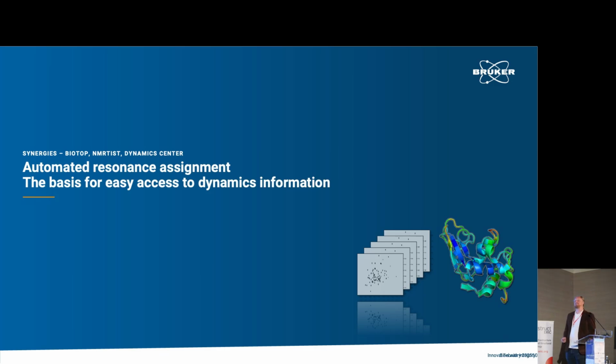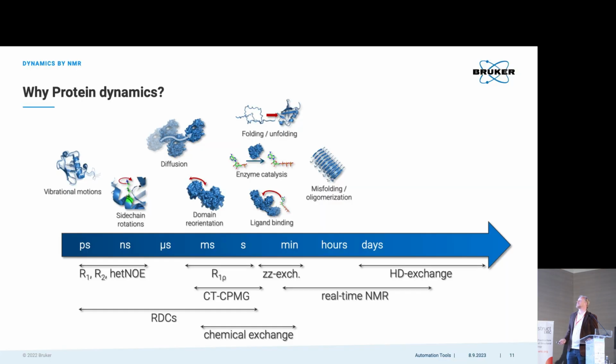Right. As I said, I think the true potential of this is not necessarily solving structures. While this is nice, and there's probably always going to be the one odd example where no other technique is going to get you there, and then you'll revert to NMR, I think there are better uses for this. As you have seen in this three-step approach, one of the byproducts is the resonance assignments. So, and forgive me for showing a slide like this.